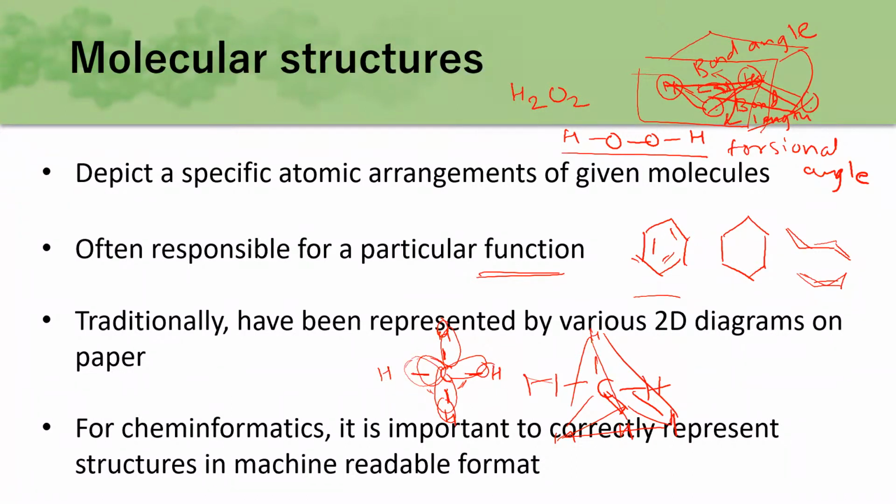So it will stabilize itself at a certain equilibrium position of the atoms, giving the lowest energy or more stability. So the aim of molecular docking representation is to represent these molecular structures in their most stable conformation to be used for any kind of computation that we do.